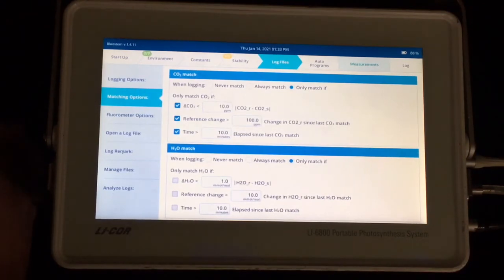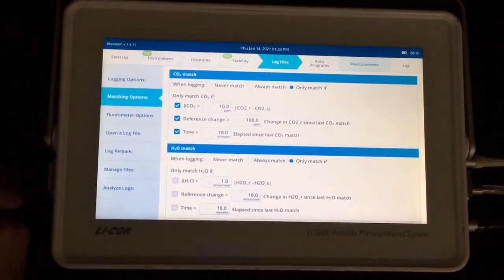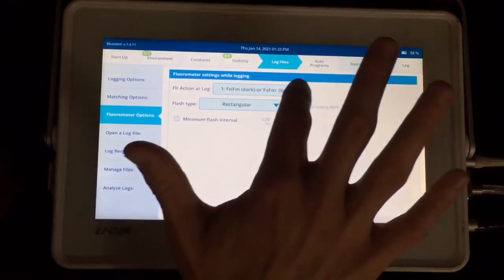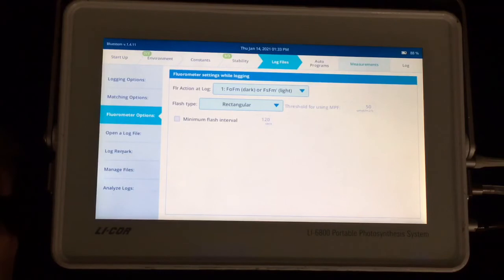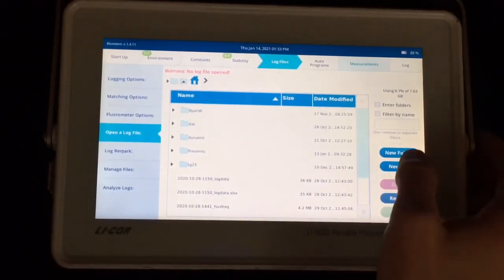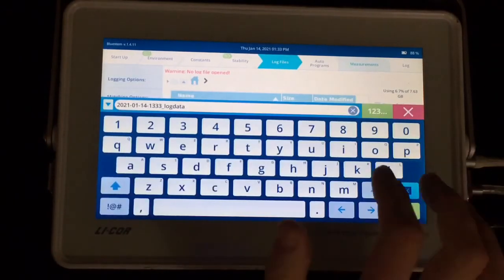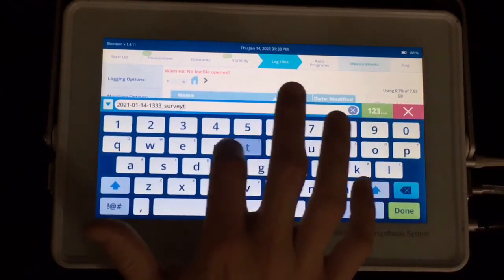You definitely need to match periodically while making survey measurements. And I like to use the conditional match. So I'm not matching every time I log a data point, which would slow me down. But I'm only going to match if I meet one of these criteria. And again, there's some choices that can be made, but the defaults are pretty reasonable there. You would want to decide if you want to give a saturating flash and make a fluorescence measurement along with each measurement. I'm going to go ahead and do that here. And you want to open up your log file. Again, this naming convention is up to you. And you can create subfolders for different projects, which can be quite nice. And I'm just going to make a survey test folder to log my data to.